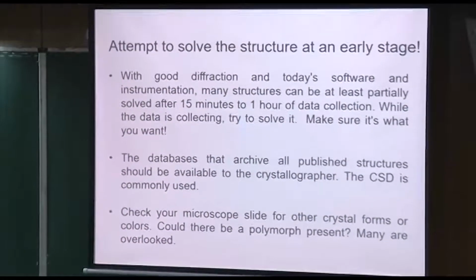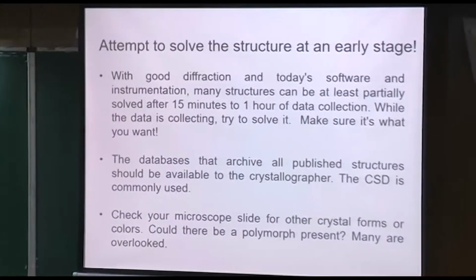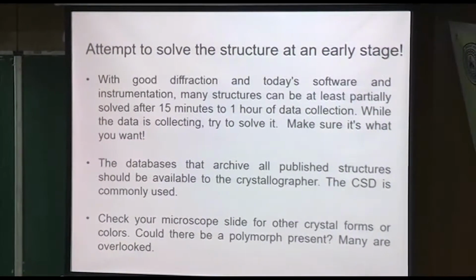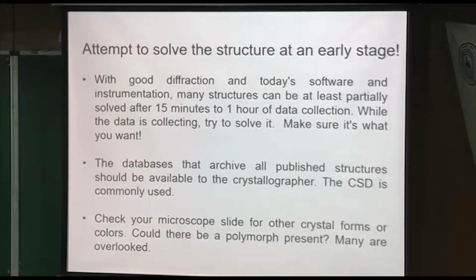Sometimes you can access the diffractometer either in the lab where it's being collected or by TeamViewer or some other program that connects to the diffractometer. You don't have to wait for it to finish. You can start reducing the data, trying to solve the structure, and after you have maybe 100 frames or something like that, you can usually get the structure. So why waste a lot of time? Somebody else might want to use the instrument. And maybe it's nothing like what you expected.